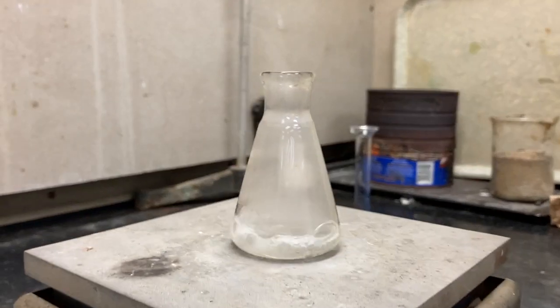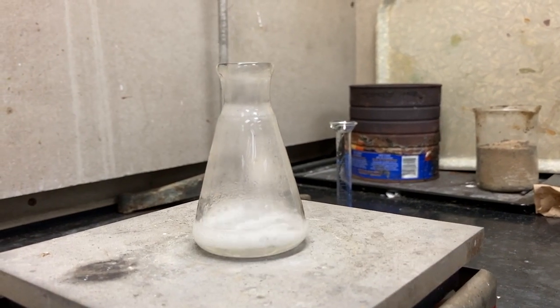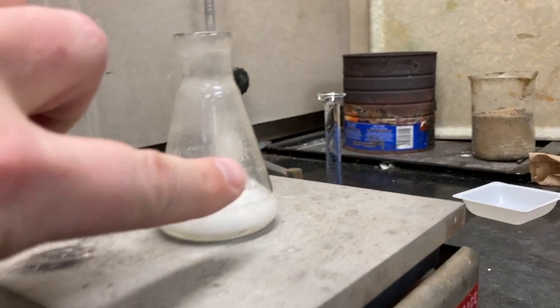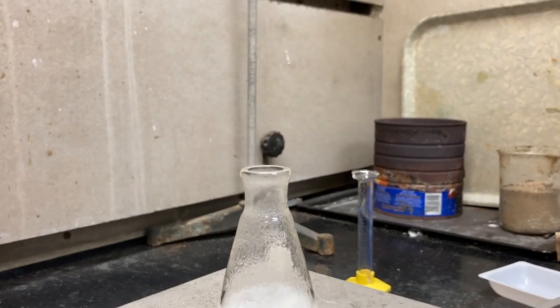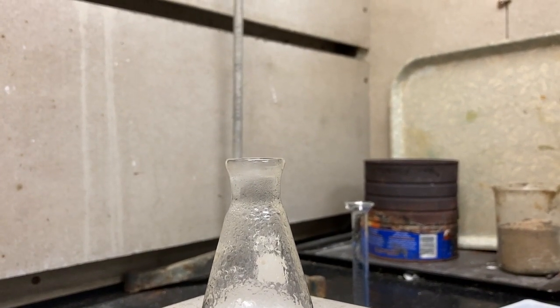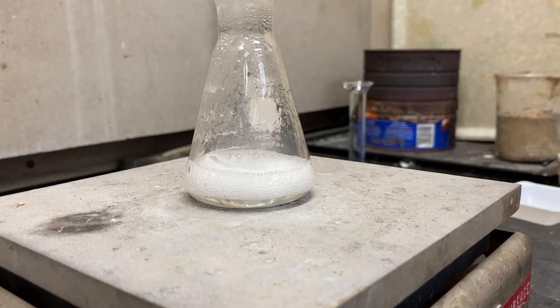Yeah, definitely see it bubbling. Looks like the flask is getting a little cloudy, some sort of liquid vapor. Ooh, it's warm. Well, it's on a hot plate. True. It's kind of hard to see, but you can see a little bit of vapor coming out the top, so there's definitely gases being produced. They're being sucked up, and it's bubbling away.